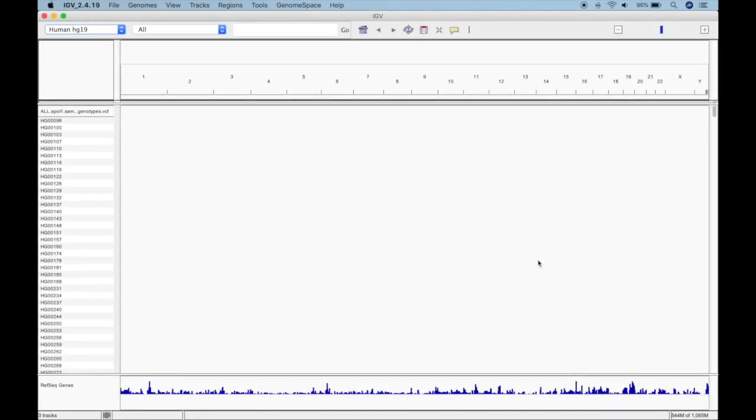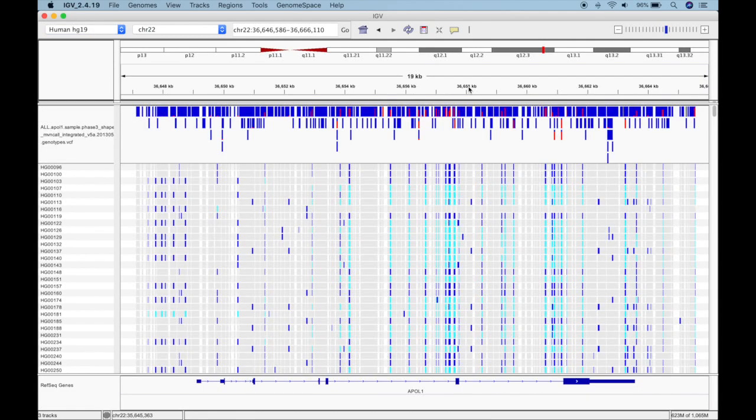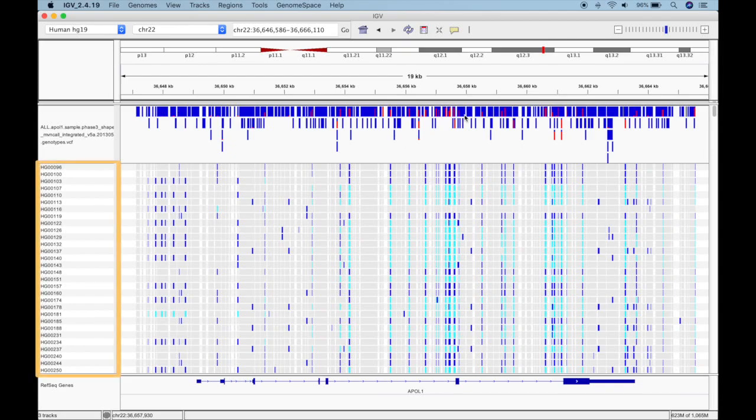Let's zoom in to where our variant data is on chromosome 22. Great. First notice the sample names on the left. Each of the 850 samples we saw in the VCF is here, even though we can only see some of them in this view.